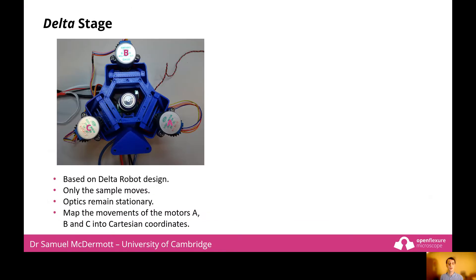The key feature of the OpenFlexure delta stage is the design of the 3D printed stage. Here we use a delta robot mechanism, a type of parallel arm robot, consisting of three arms that are made with flexible parallelograms. You may have seen similarly designed mechanisms with the Rostock design 3D printers. The sample itself remains parallel whilst moving in three dimensions, and the optics remain stationary.